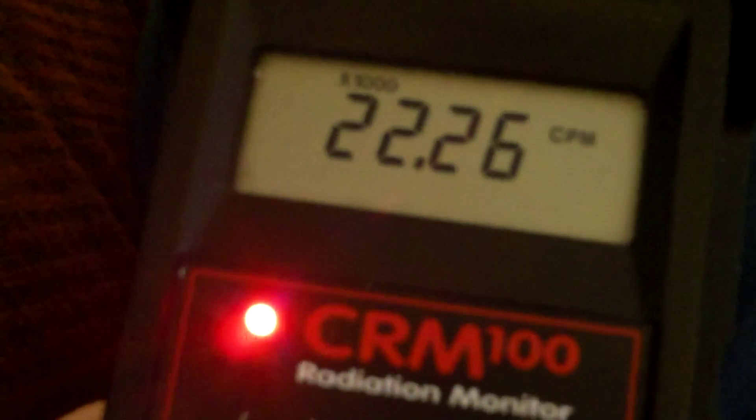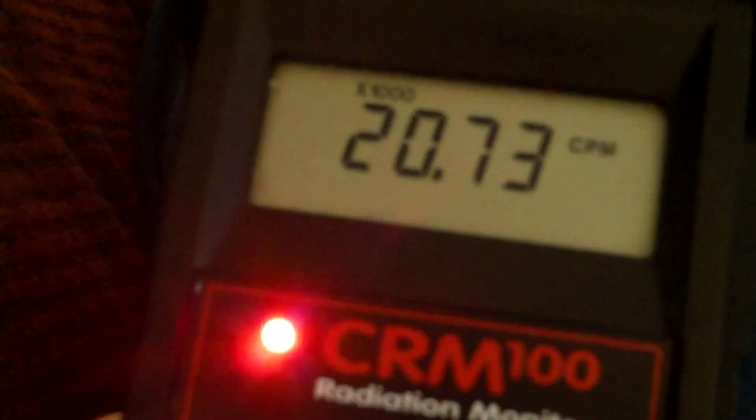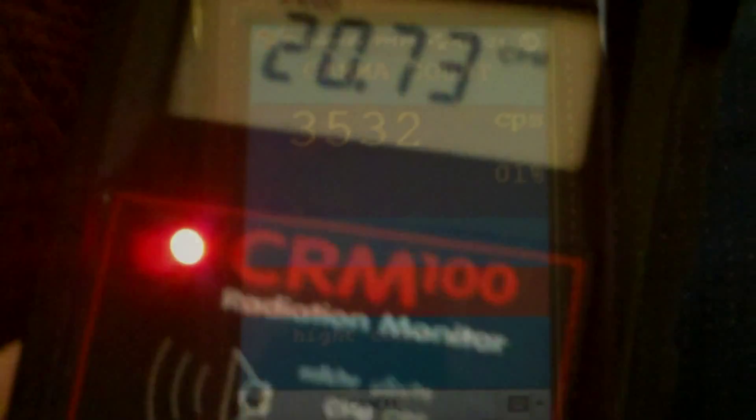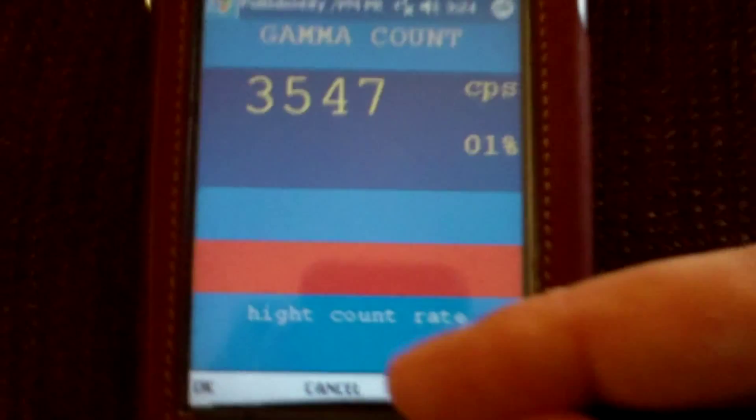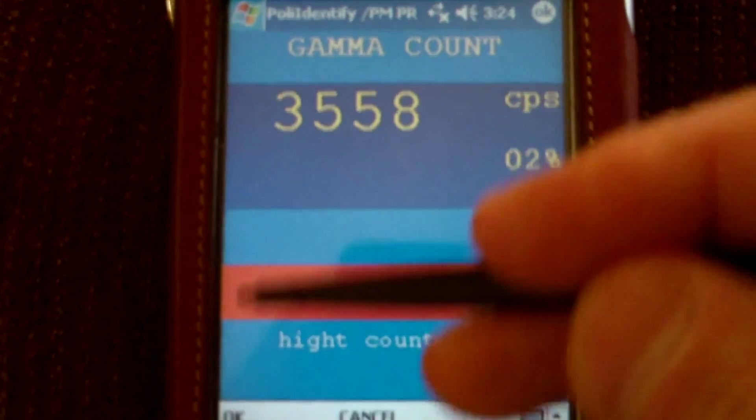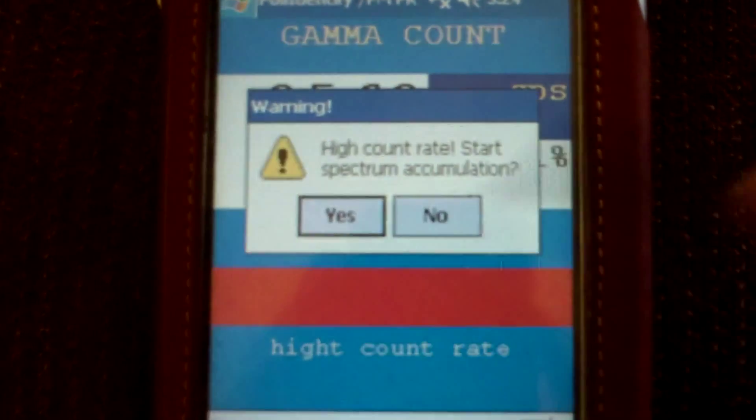It's two injections. This is Cardiolite, a common technetium-99 chemical. So anyway, I decided to capture a spectrum of it to go on with my spectrum video series.